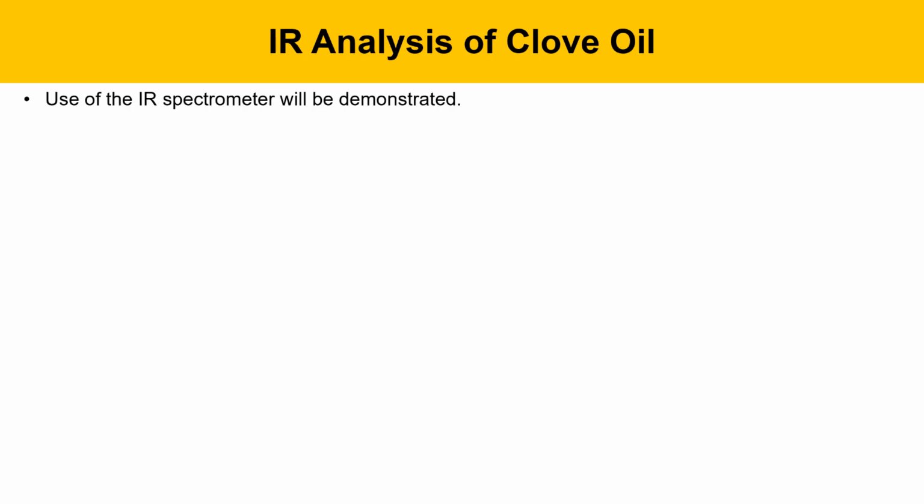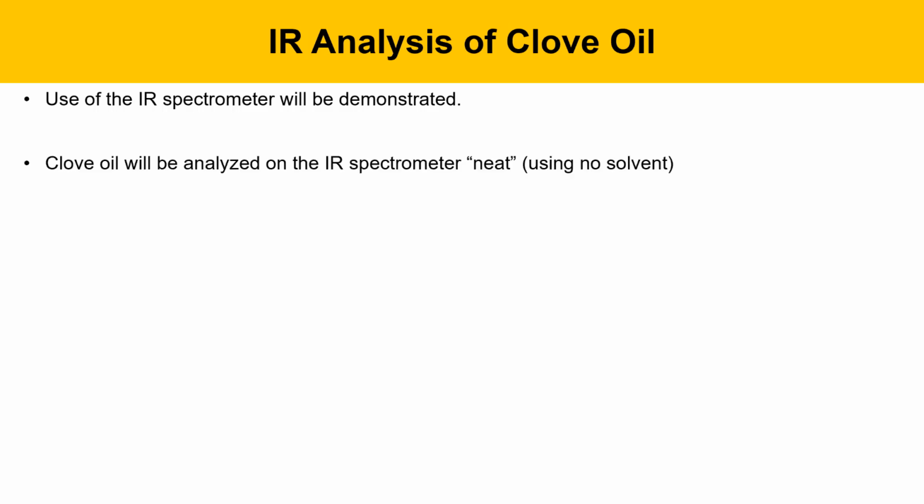The use of the IR spectrometer will be demonstrated, and there'll be a video that describes that. In subsequent videos, there'll be a demonstration of the IR spectrometer use. Clove oil will be analyzed on an IR spectrometer using no solvent.